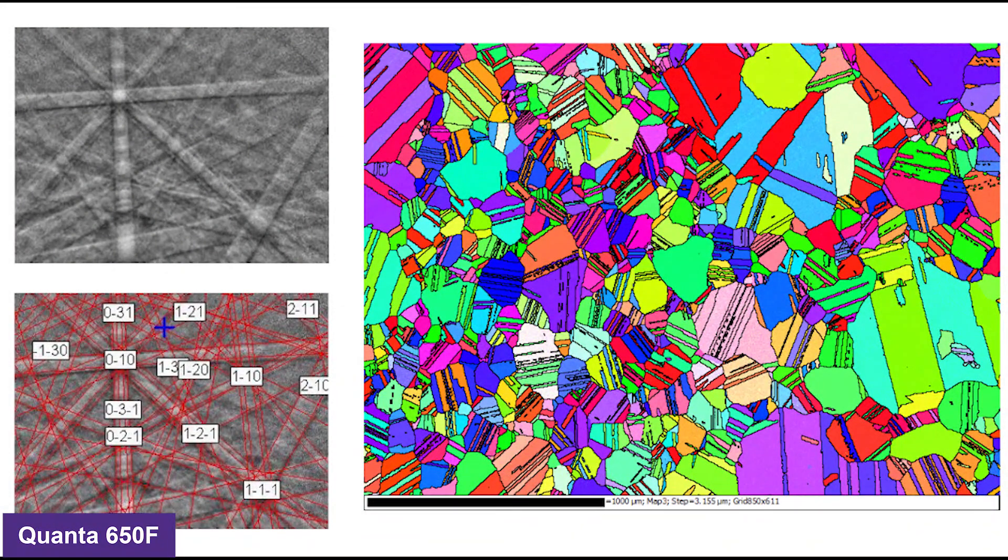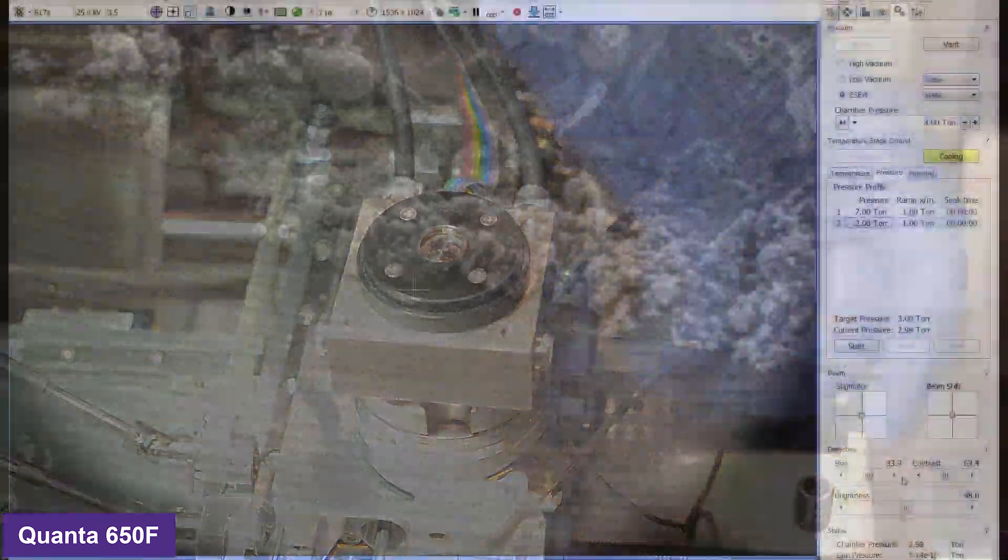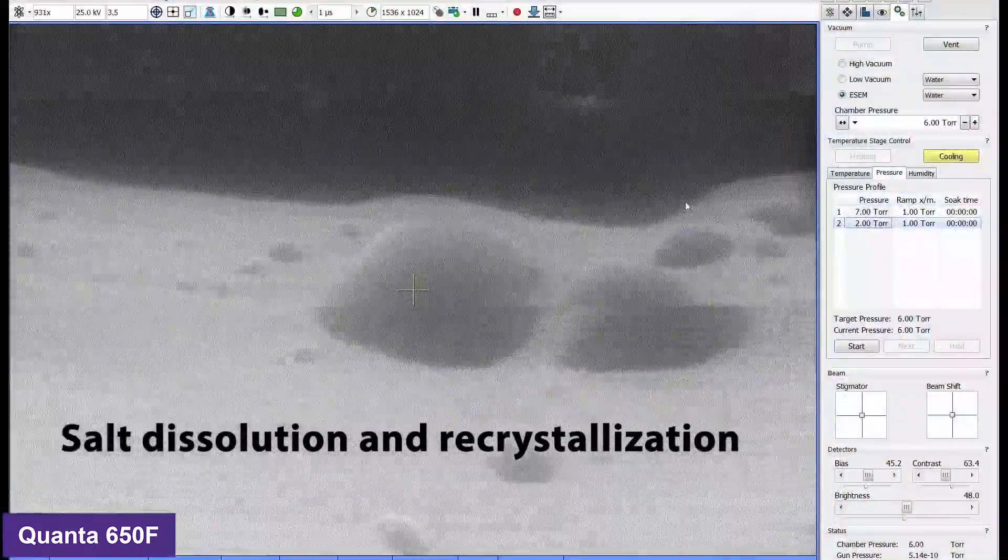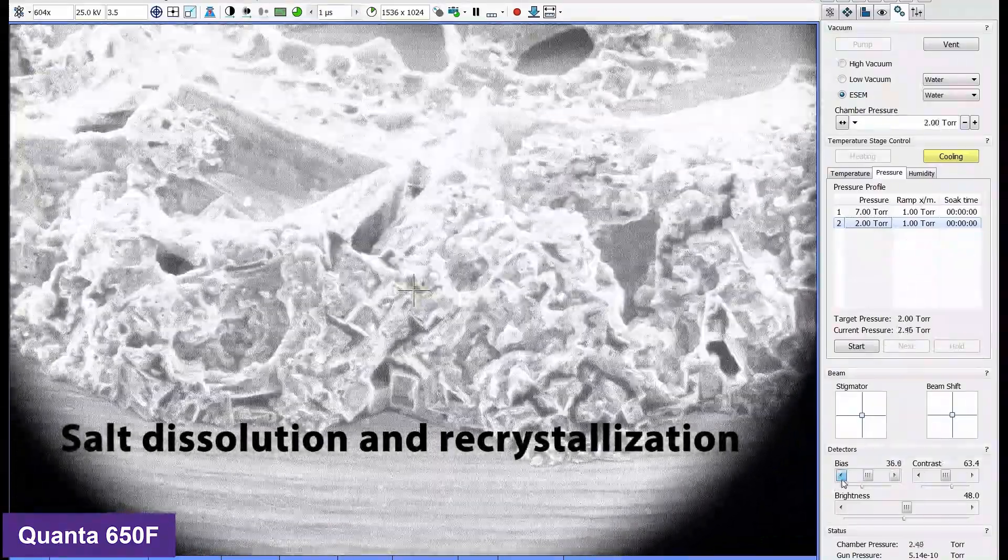The QUANTA also has an electron backscatter diffraction detector, or EBSD detector. This detector gives you crystallographic information about the microstructures in the sample. And finally, this SEM has a Peltier cooling stage, which allows you to cool your sample down to 10 degrees C. With water vapor present in the chamber, this allows you to condense water on the surface of your sample.